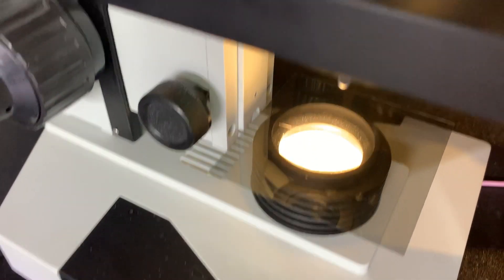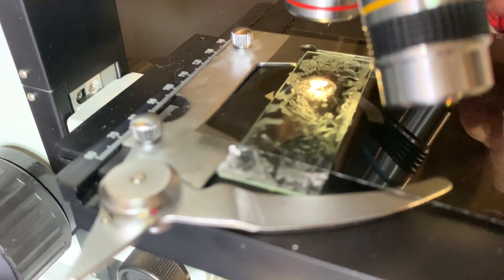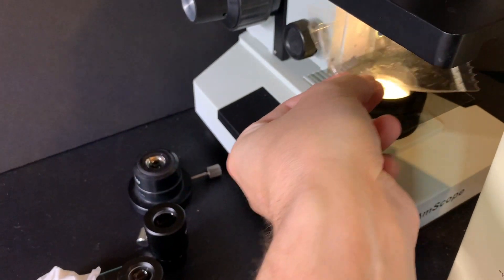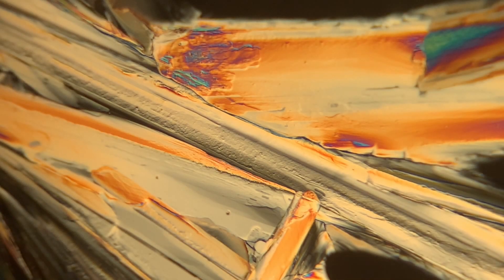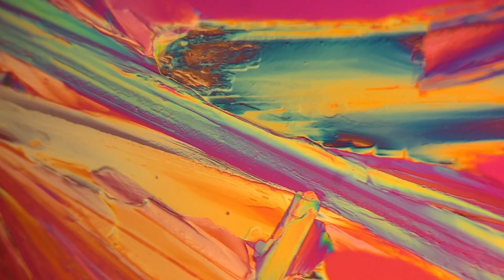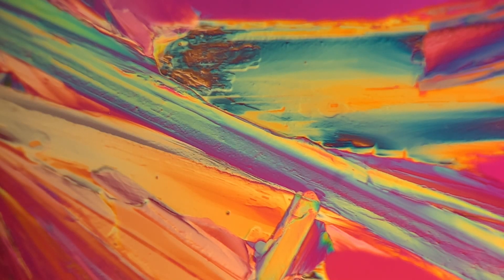Normally with looking at crystals under the microscope, I like to add these polarizing filters. And to make it a little bit more colorful, I often add some tape as well — this is just regular scotch tape. So this is what it looks like without any filters, and then here's what it looks like with just the polarized filter on it. Now I'm going to start adding the tape, and just moving the tape in different angles, you're able to get a lot of really cool color.